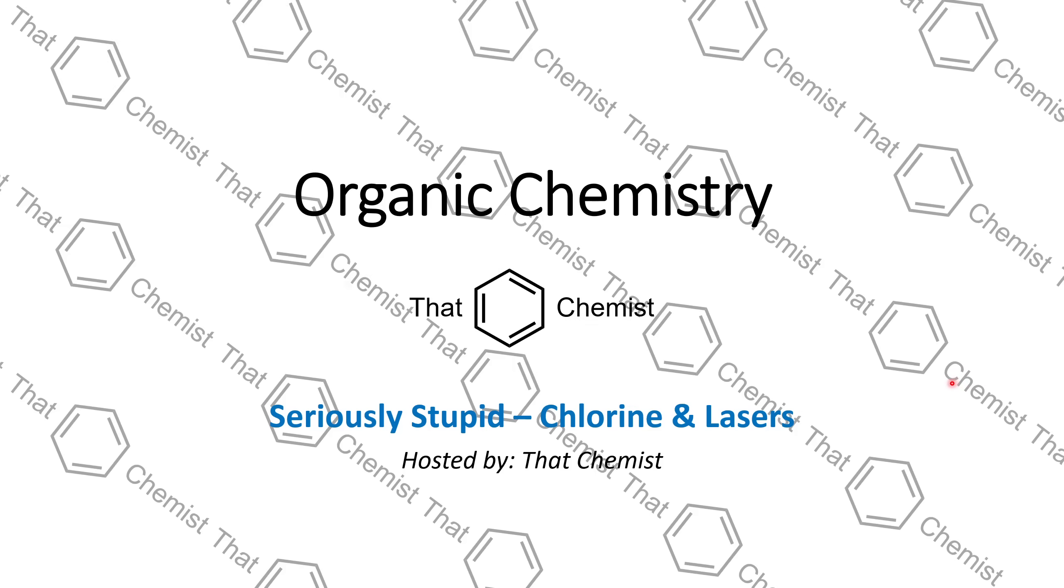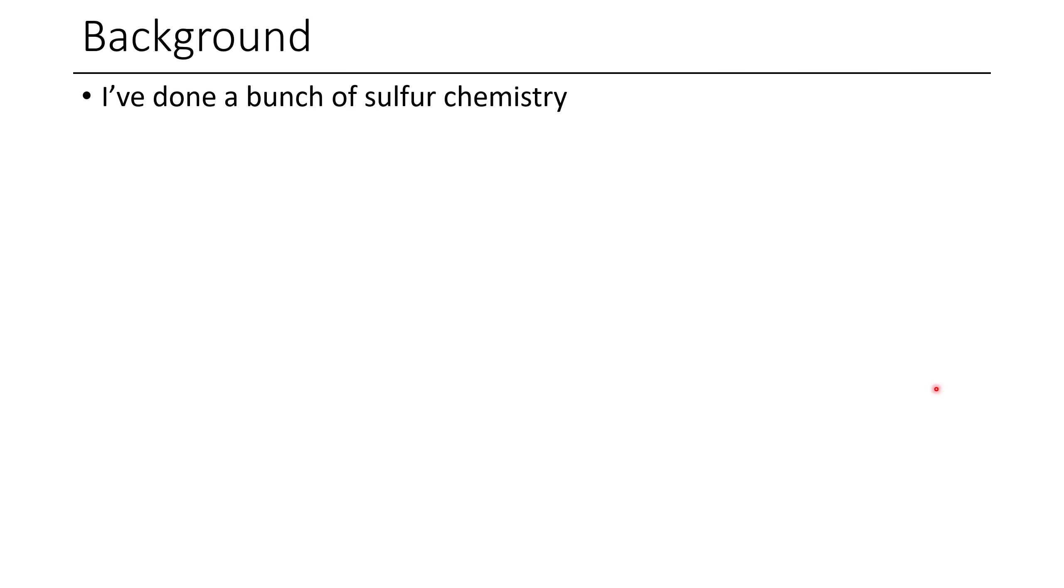Welcome back, I'm ThatChemist, and today we have another episode of Seriously Stupid, where I tell you about a story regarding chlorine and lasers.